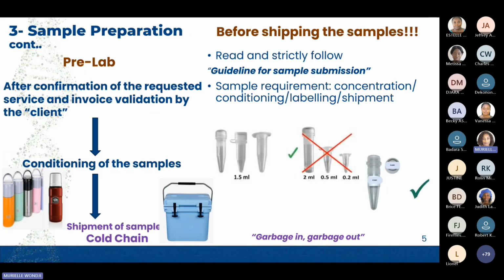So concerning still the sample preparation, before shipping your samples, there are pre-lab steps that we really have to get clear. After confirmation of the requested service, meaning when you contact us, we have time to discuss exactly what you would like CRID to offer to you. Then we will agree and issue an invoice that you will have to validate to allow us to go ahead.